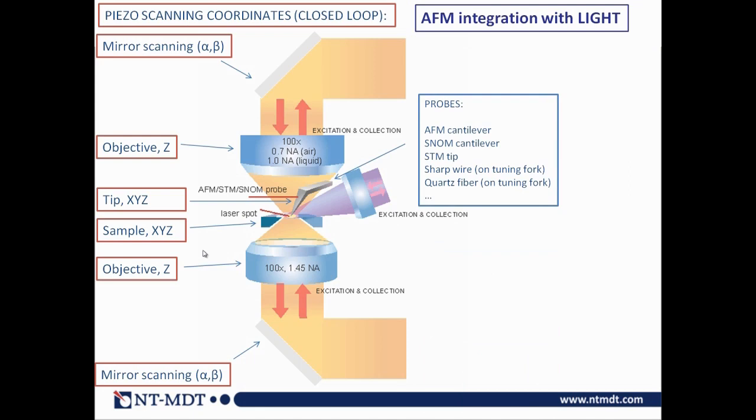Different probes, of course, can be supported: standard AFM cantilevers, SNOM cantilevers, STM tips, or just sharp metal wires or quartz fibers attached to tuning forks. So basically all standard and non-standard AFM probes can be installed into this instrument integrated with optics.